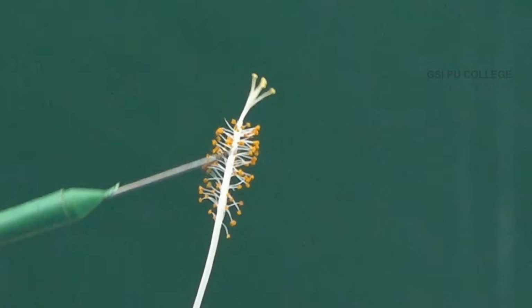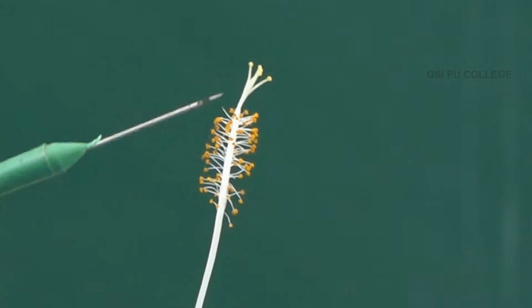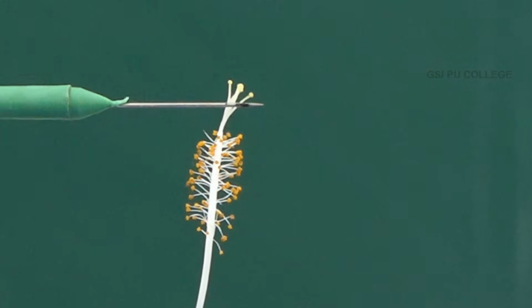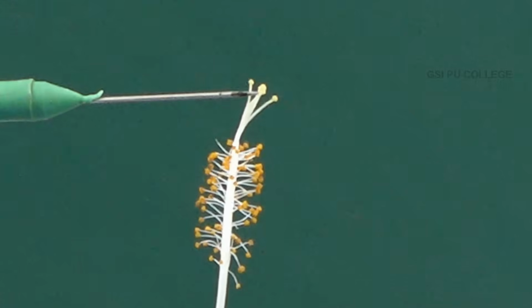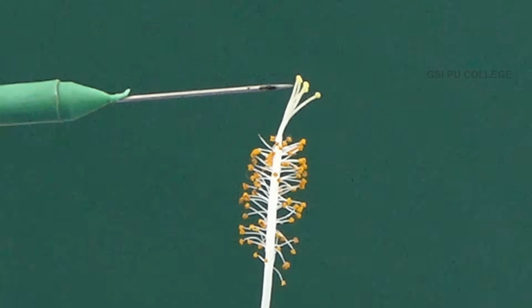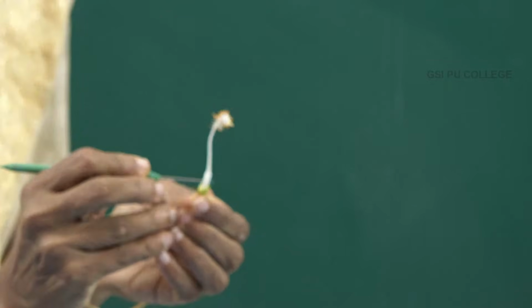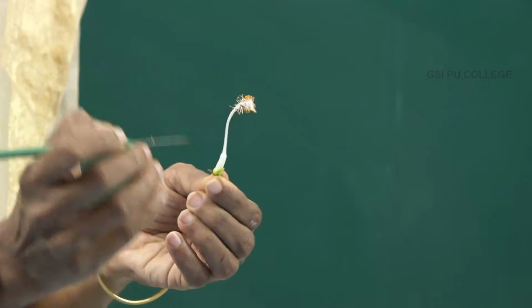Coming to the next one, these are the yellow structures. These are the Androecium, which consists of male reproductive structures called stamens, and the terminal five very small parts are the stigma. Now we have to remove the Androecium like this.